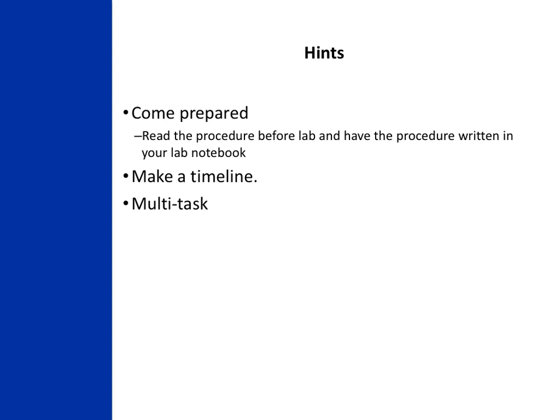You will want to identify what measurements you will need to take so you have space for them already indicated in your lab notebook. Make a timeline. This is a long lab experiment, so it's essential that you have an idea of how long it will take for you to perform each step, keeping in mind some steps require a bit of a waiting period. This also helps you figure out which steps and where you can multitask.